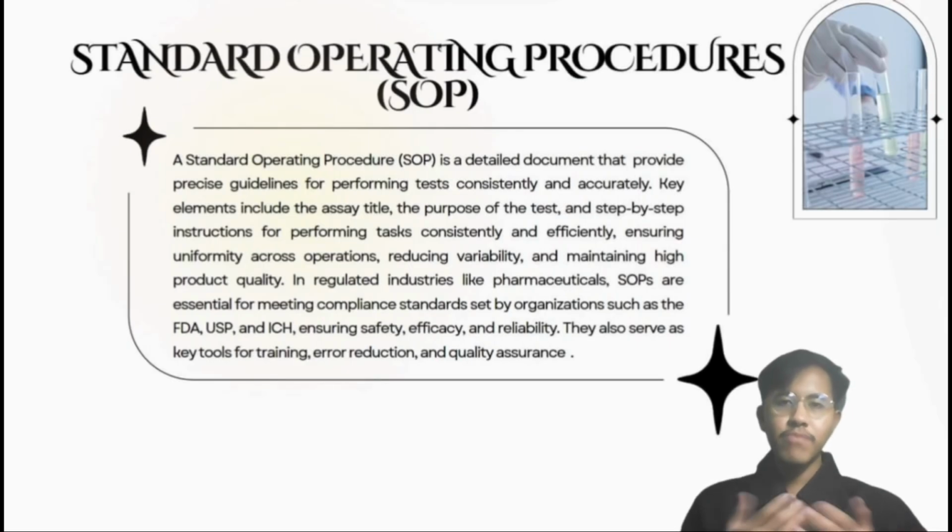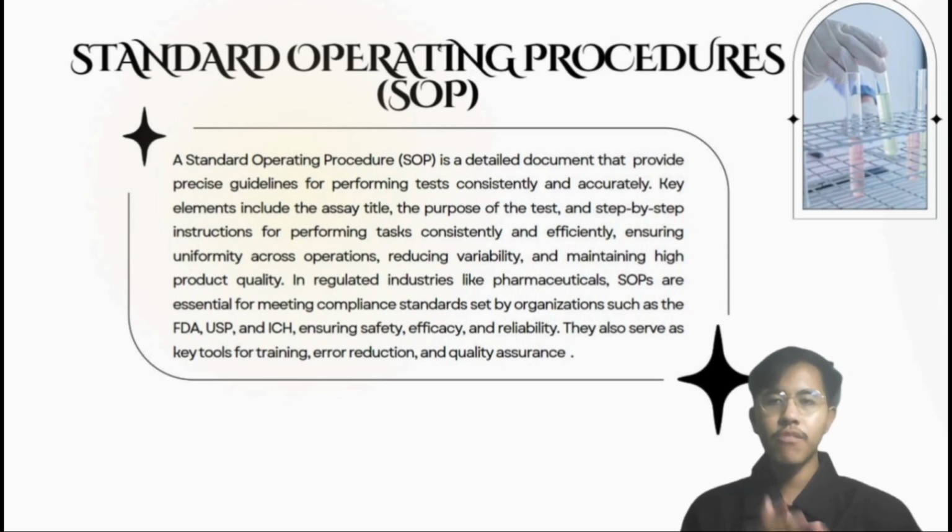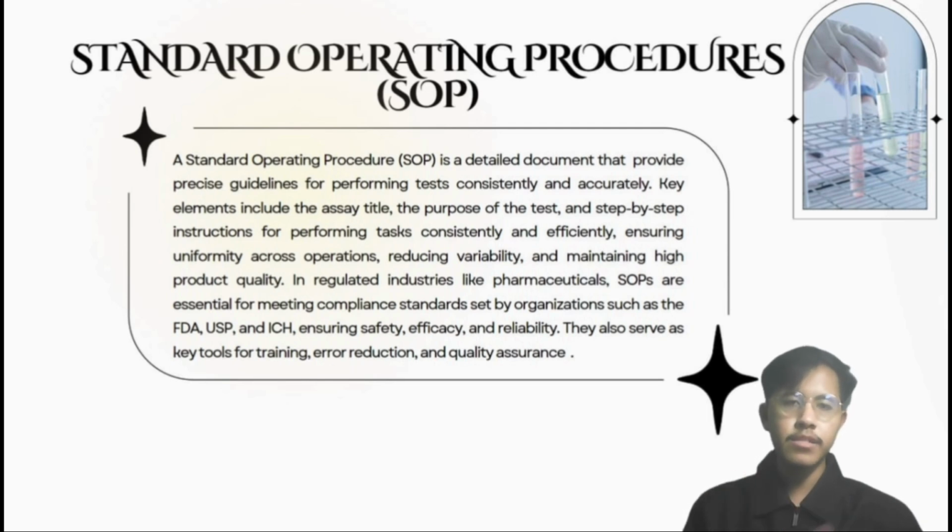Next are the standard operating procedures for atropine eye drops, which is atropine sulfate ophthalmic solution. For our products, there are several tests that will be conducted to ensure the product meets the quality, safety, and regulatory compliance standards, adhering to guidelines such as the USP guidelines.